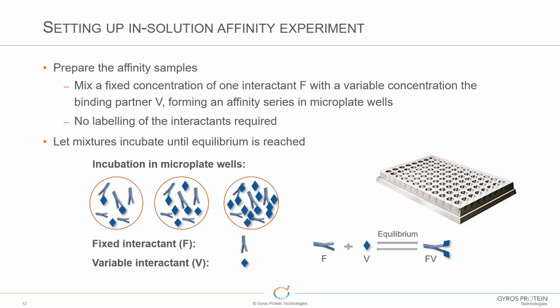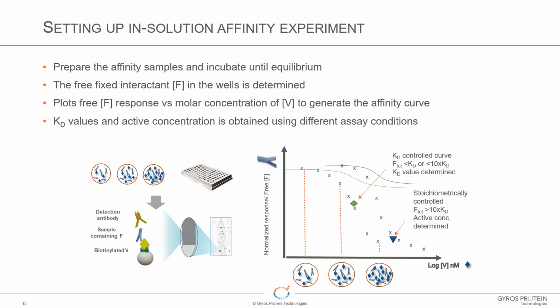And I think that's the thing, you don't always know what the interaction affinity actually is. So you may want to do the incubations for 2 or 3 hours, and then maybe do an overnight incubation, then compare the data and see which gives you the most accurate determination of the KD. But the good thing about the Gyrolab being so quick is you can set up all these experiments and just run them, and you get the results in an hour. Yeah, one right after another. Exactly.